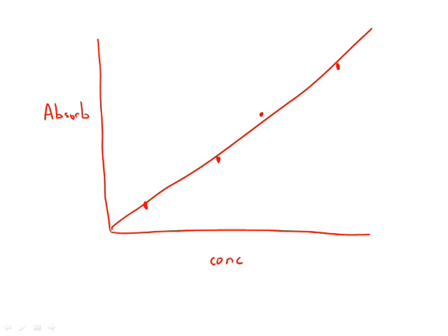So for any absorbance you measure, say you stick it in the colorimeter and you get this absorbance right here, you can either use the graph, or maybe even better, you can use the equation for the line, and calculate whatever this concentration is right here. So that's the calibration curve that you made last week.